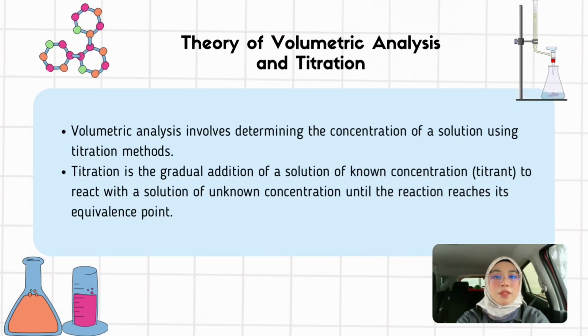Volumetric analysis involves determining the concentration of a solution using titration methods. Titration is the gradual addition of a solution of known concentration, the titrant, to react with a solution of unknown concentration until the reaction reaches its equivalence point.